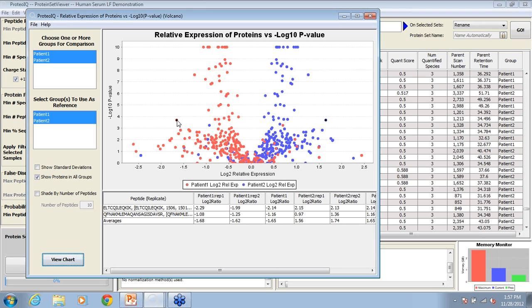Interrupt you for just a minute. Sure. Shinji had a question. Our lab wants to use formaldehyde labeling and N-dimethylation to quantify peptides. Can ProteoIQ do that? Yes, we've done lots of dimethylation experiments. So I'll tell you what, I can show you how to set that up right after this, if that's okay. What I'll do is I'll jump in and we'll do a quick project setup for a dimethyl experiment.